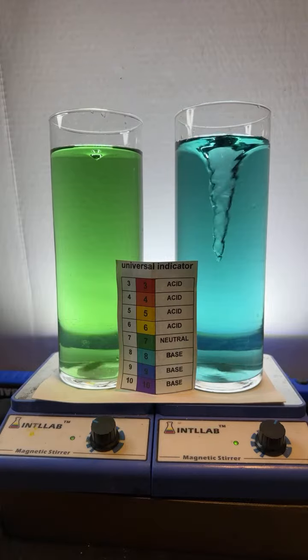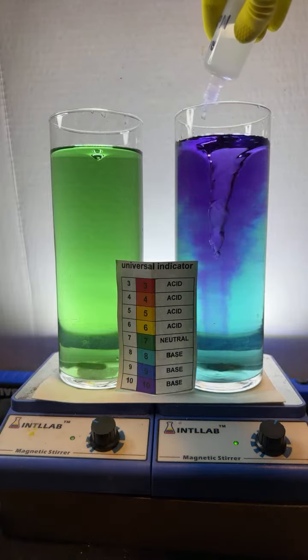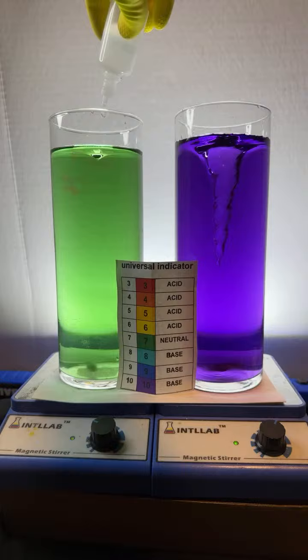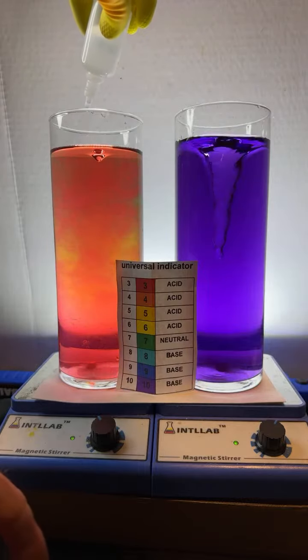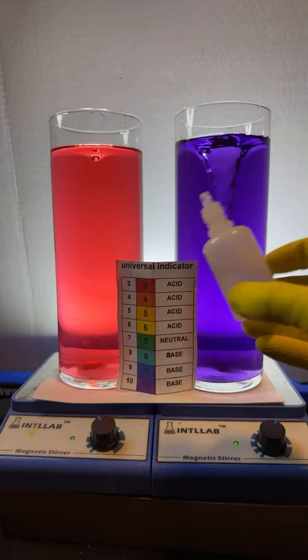Isn't that cool? All right, let's get this one basic. I'm adding base now, and you can see the pH increases. We're going to get this one over here acidic. I'm going to add acid. The acid that I add is hydrochloric acid. It's the same acid that's found in your stomach, except this stuff is a lot more concentrated. So it's like one drop of this stuff has as much acid as like 10 human stomachs.